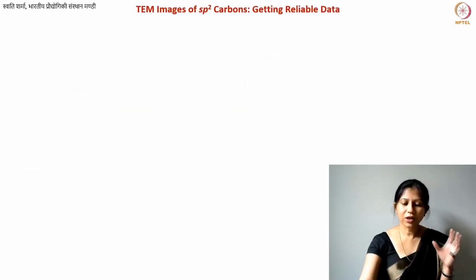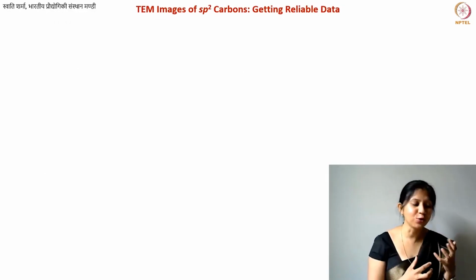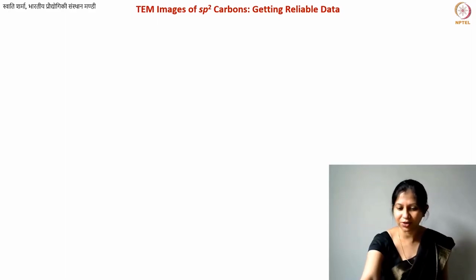Okay, so on this slide now I'm telling you how to get reliable data from TEM, or how to do a reliable interpretation. Basically, it's not like this is a very expensive equipment and you can never get any reliable data from it. But there are just a few tricks that you need to make sure that you're factoring in.